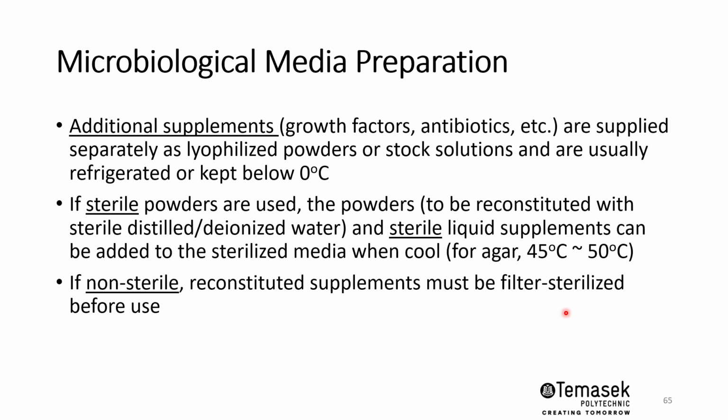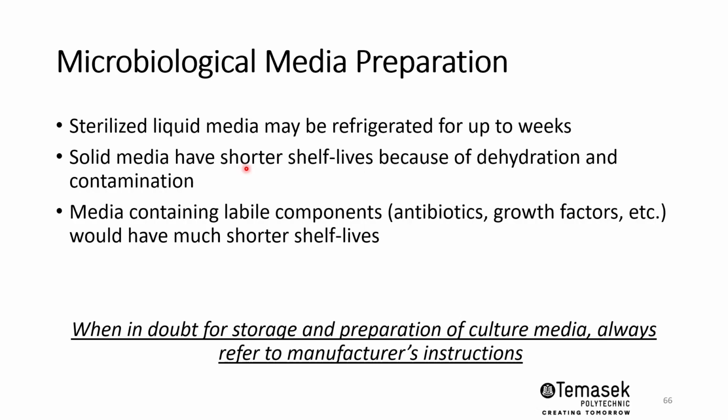So the sterile liquid media prepared may be refrigerated in the fridge for up to several weeks. Solid media itself, like agar, has a shorter shelf life because they are subjected to dehydration as well as contamination. The media may contain certain labile components such as antibiotics and growth factors, which will eventually lead to a shorter shelf life for the media itself. So whenever in doubt about storage and preparation of the culture media, we will always refer to the manufacturer's instructions. Usually this comes in the form of a brochure or leaflet to inform the user on how to prepare the media as well as how to store it.